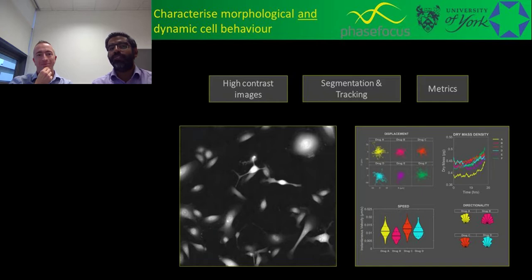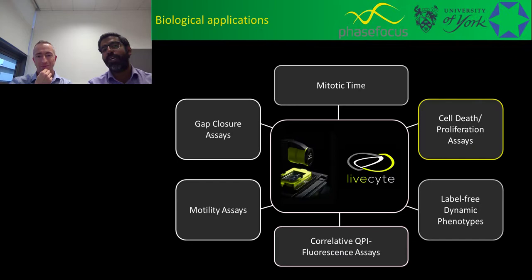Because at the end, we need the numbers to describe what's happening in those videos. We want that beautiful Nature paper, and we need to quantify. We can't just put in a video anymore and say, this looks great, cells are moving. We need to be able to quantify. So in the next few slides, I'll show you some of the applications and how we can quantify.